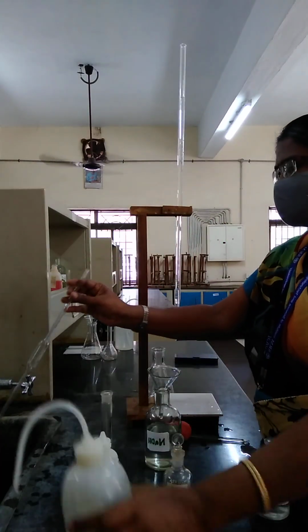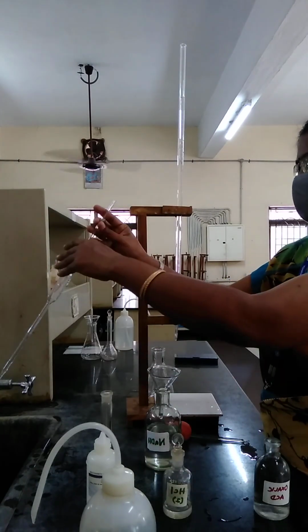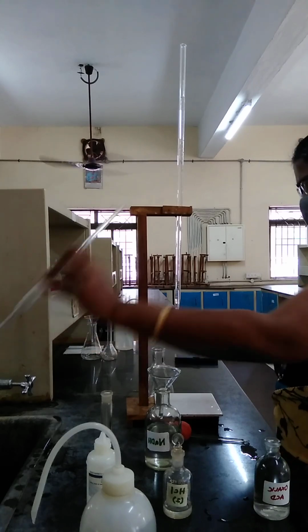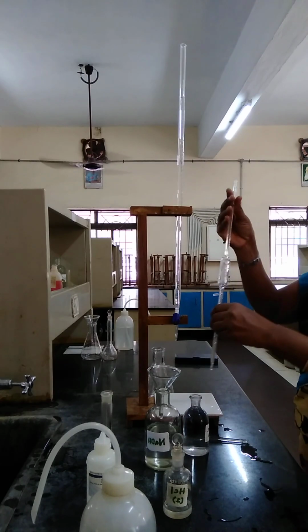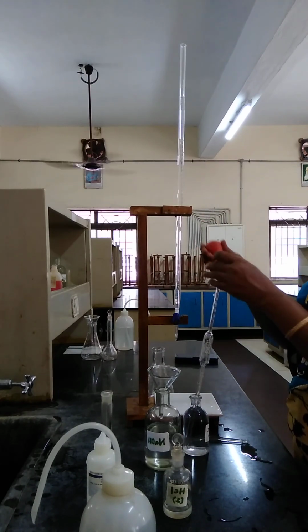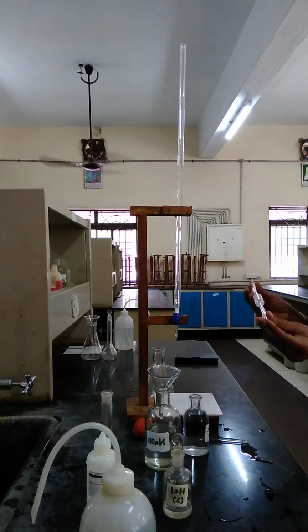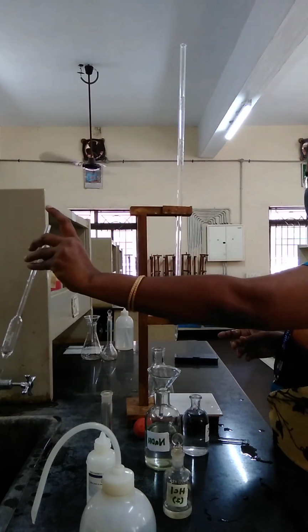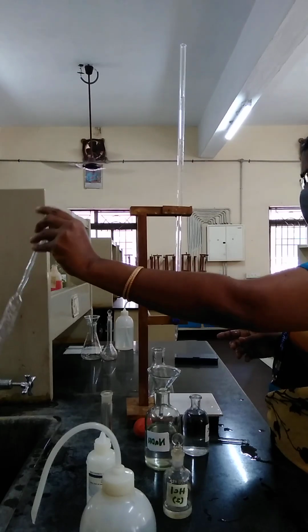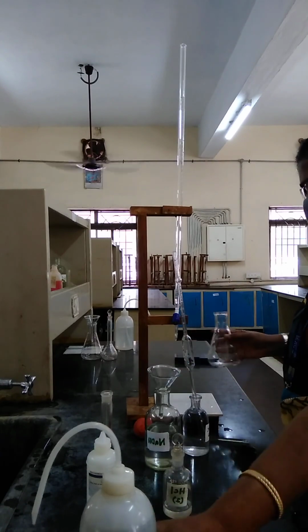Okay. So now you wash the pipette with distilled water. A little quantity of the oxalic acid you take and then rinse. Okay. So the oxalic acid is the known one. You can say we ourselves prepared it with the known normality, 0.1 normal oxalic acid. Now we rinse the pipette with the oxalic acid also. Now pipette 20 ml.